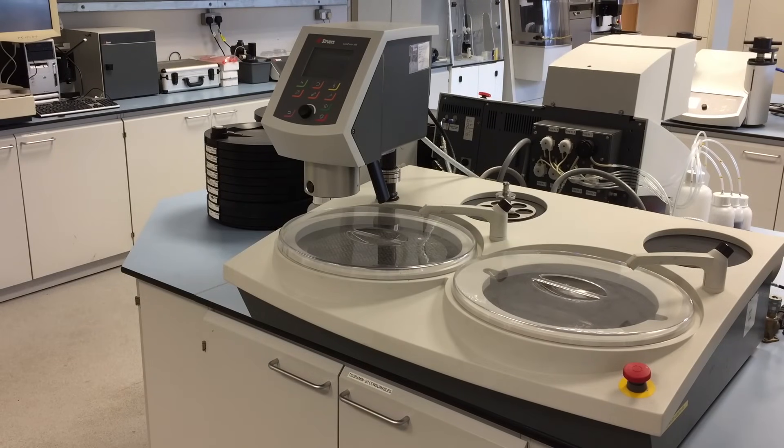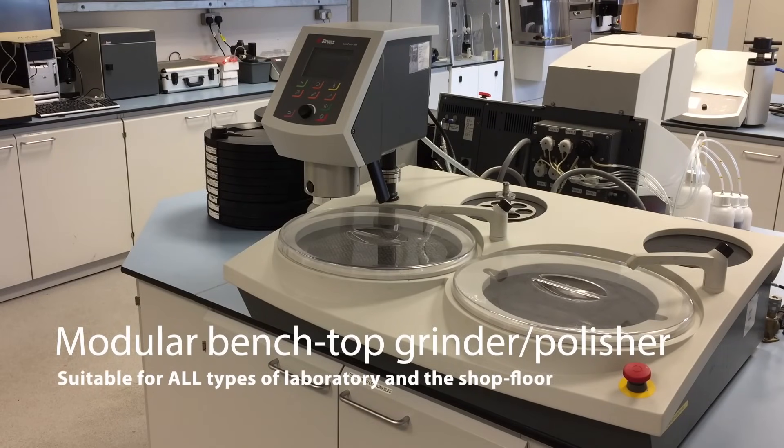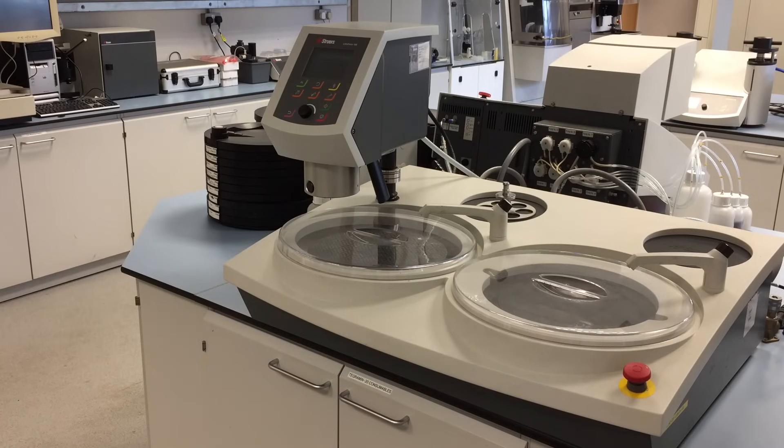This video will review the LAVO system, which is Strew's adaptable range of modular grinding and polishing equipment. Here you will learn how the equipment works, the different available options and the benefits of this product.